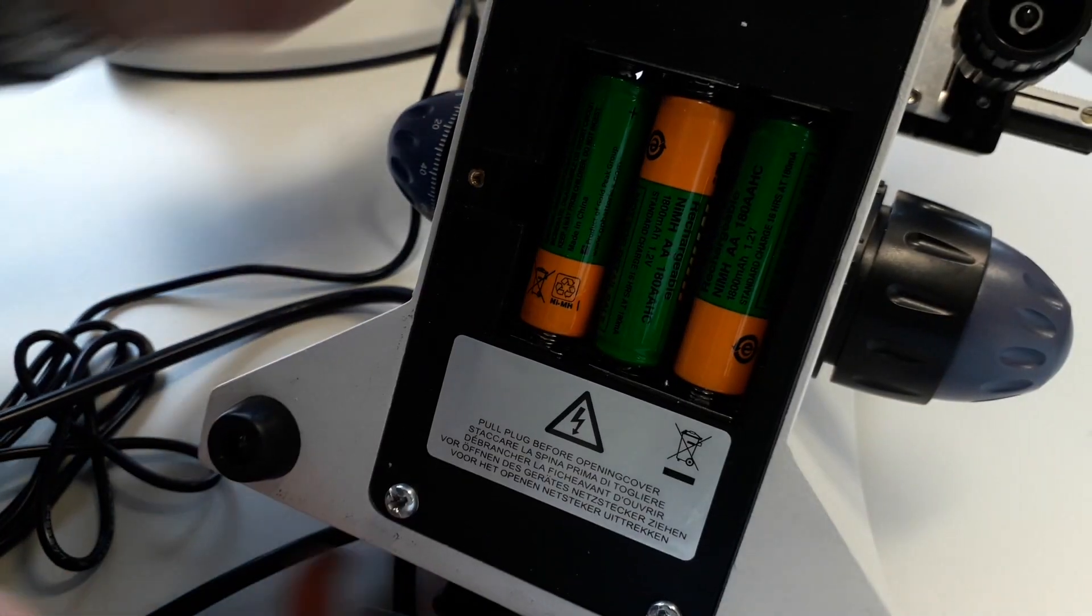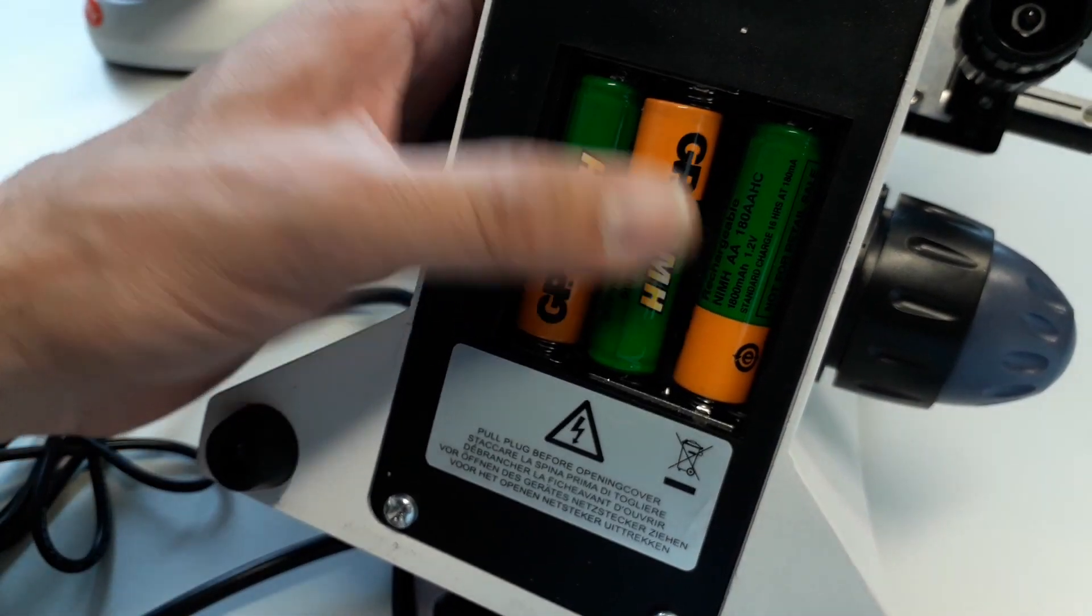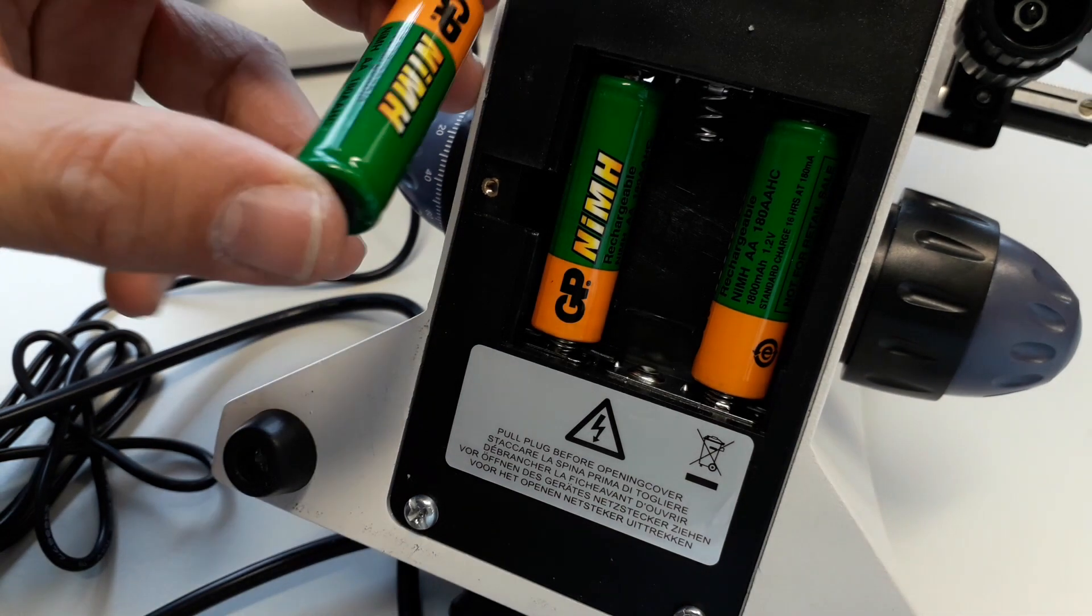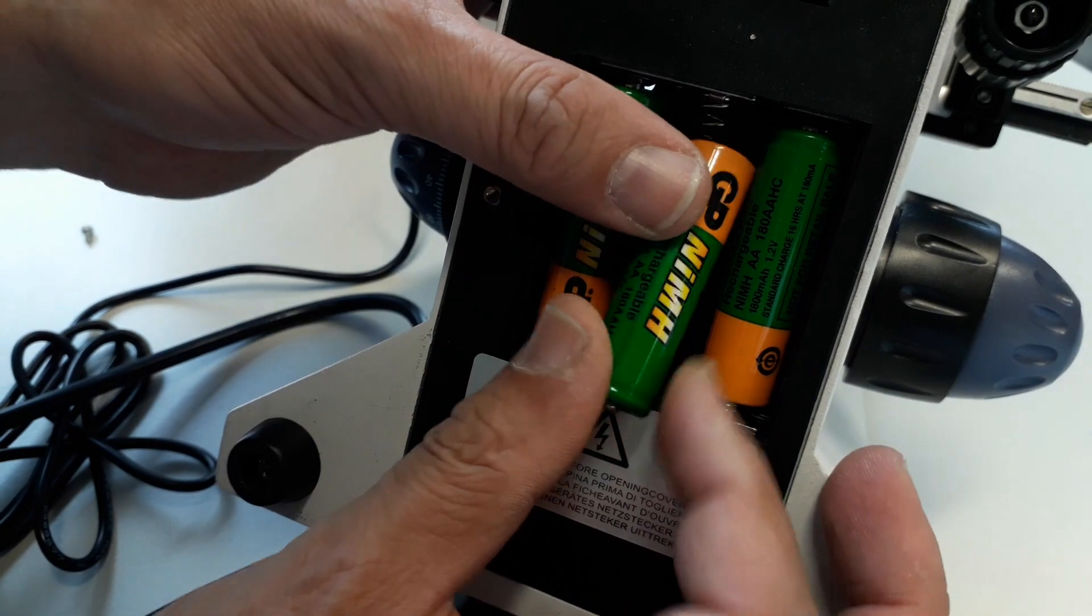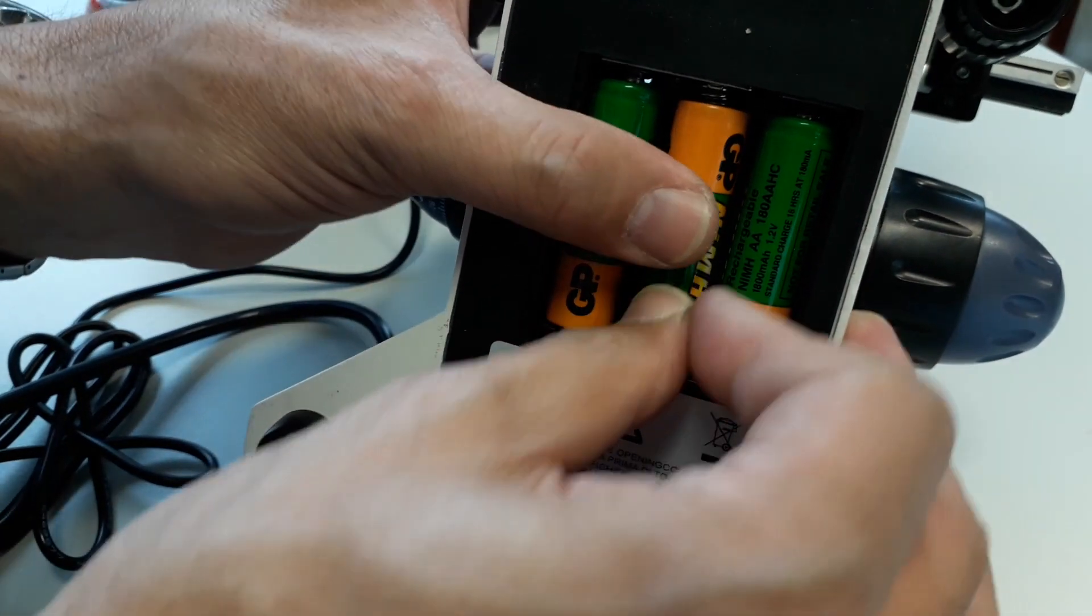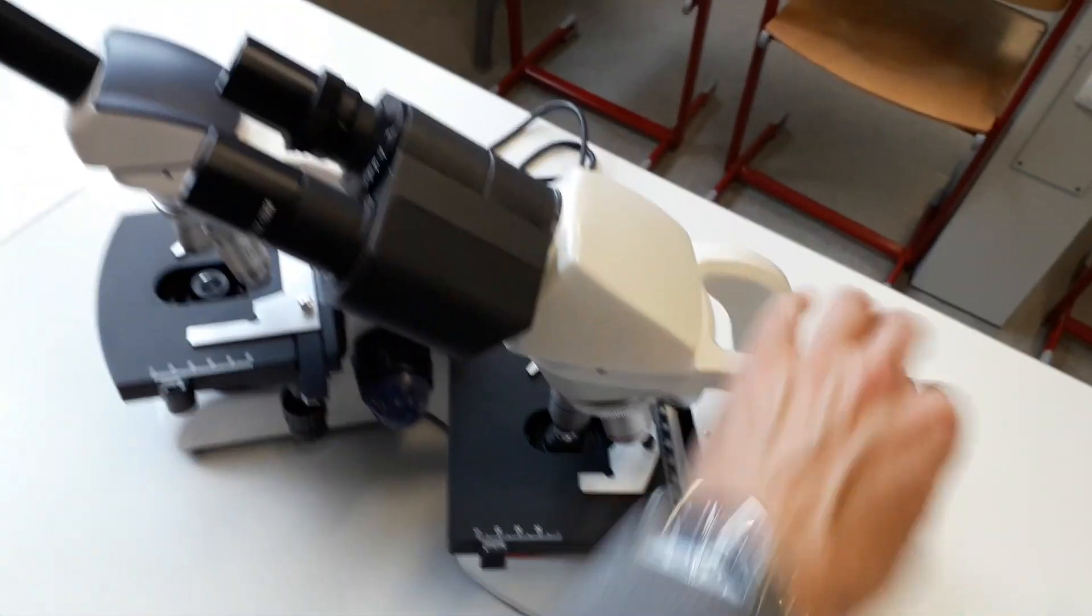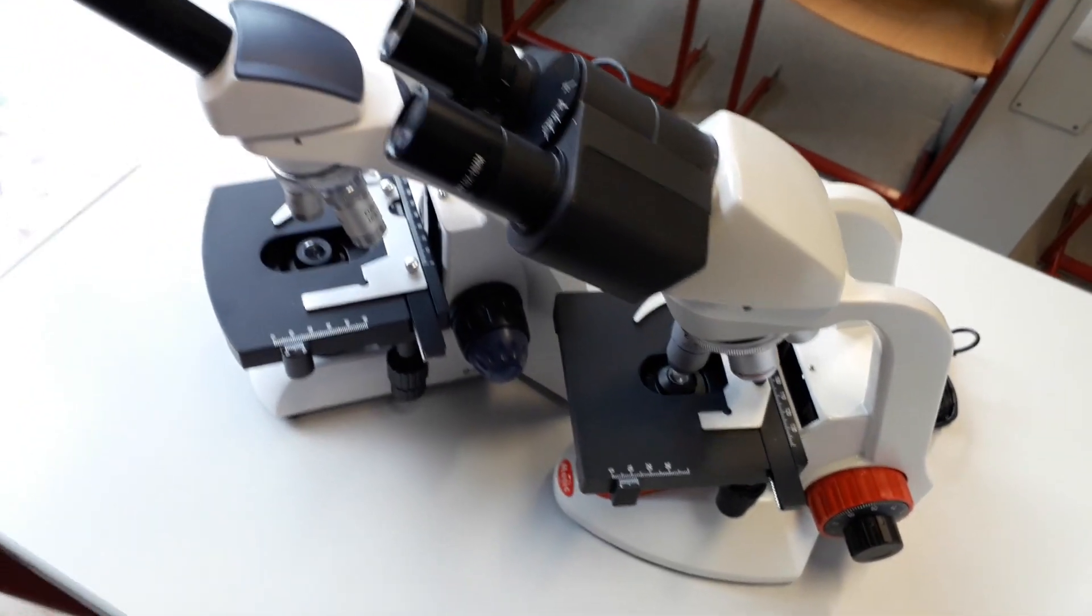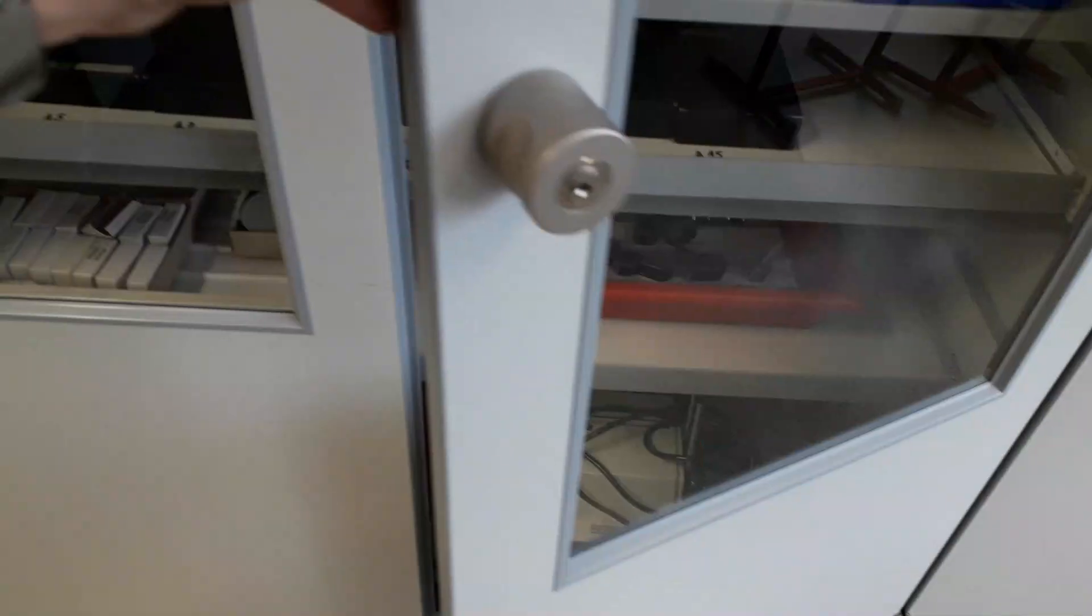So that is, of course, also a possibility that we have. If there is no power supply available, you can use batteries. Not something that we absolutely need or require, but at least it's a possibility. Now this one is, of course, a little bit more expensive because it has a binocular head. But ultimately, I think they're pretty much the same. Let's have a look at a few specimen slides.